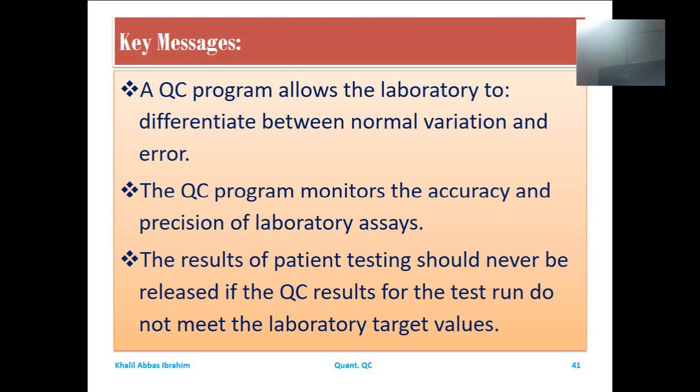You agree to work unscientifically and unprofessionally if you are not adopting any type of quality control program. So as to detect and resolve those errors, you need to adopt a quality control program effectively designed, endorsed and assessed.